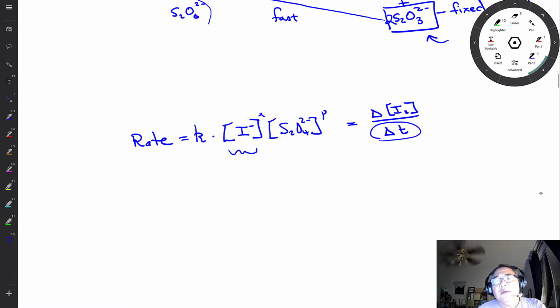So these are things to think about while you do your calculations. We'll look at two other aspects of this reaction. We'll try to get at the activation energy of the reaction by measuring the rate constant of the reaction as we change the temperature. Okay, so we're going to have a couple of different temperatures, and a couple of different rate constants. We'll be able to create an Arrhenius plot, and from the Arrhenius plot, we should be able to get the activation energy for the reaction, is what I meant to say. So that's one aspect. We're going to do the kinetic studies to figure out what the activation energy is.